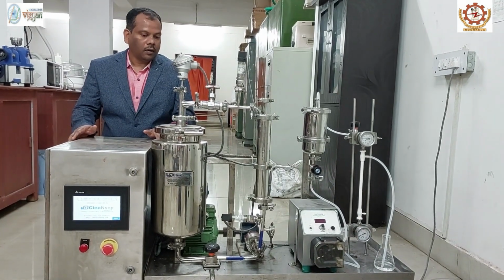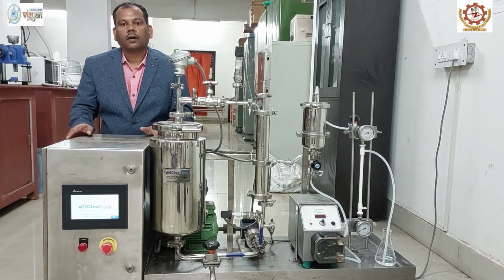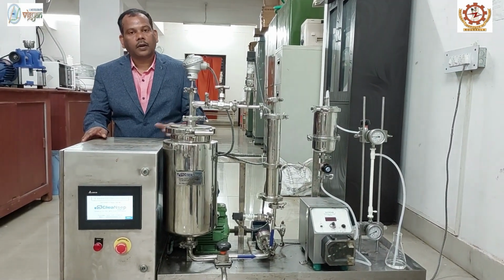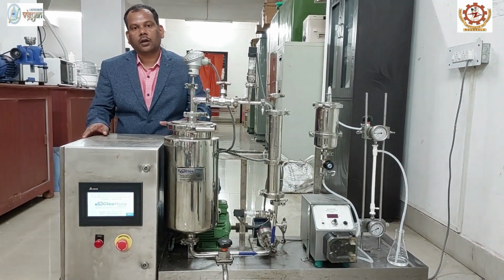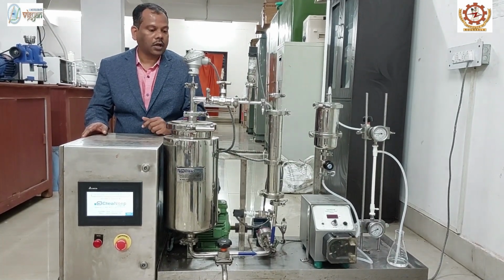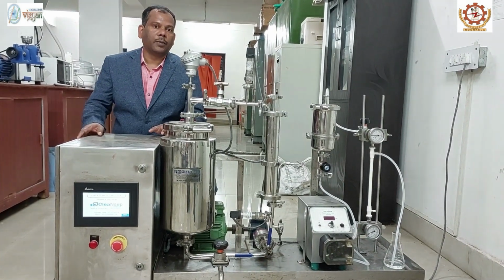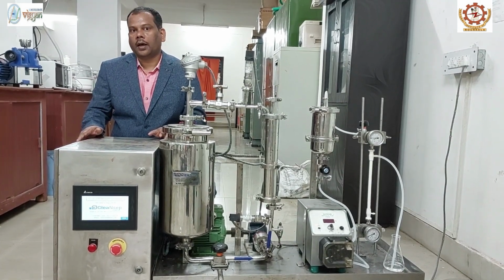Before starting this demonstration program, my research scholar Mr. Abdullah will explain in detail about this membrane filtration unit. He will show you the demonstration, the components, and the specification, including washing and other parts of this membrane filtration unit. So over to Abdullah.